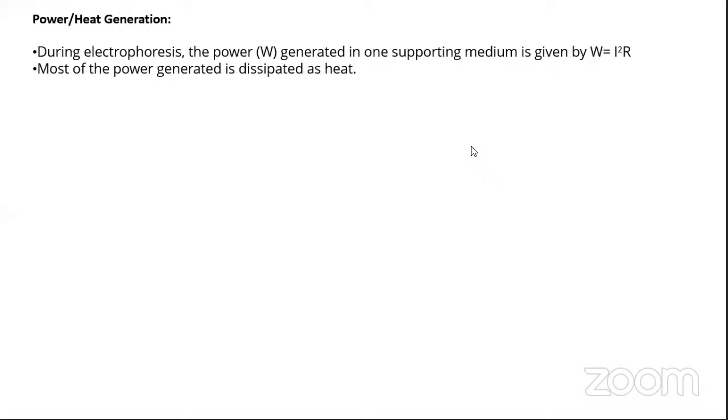Resistance will decrease. Okay, Sarvesh, now analyze your own response previously. Sarvesh, what did you say about resistance when I asked about the power? You said it will increase. Now you are saying that it is going to decrease. Why this change? Once you answer this, perhaps I will put up another question for you to find out whether you will get a good separation, because that's the purpose of all this, right?